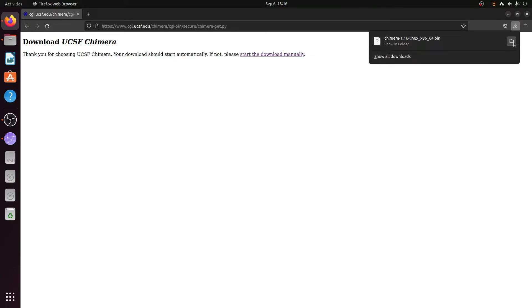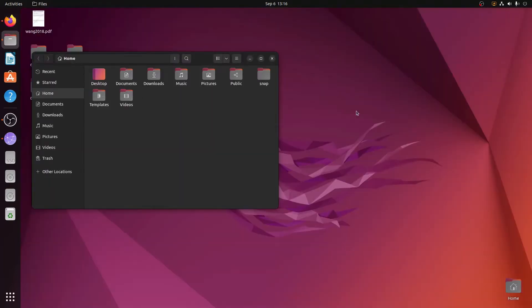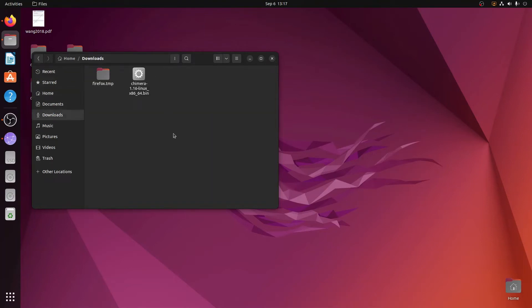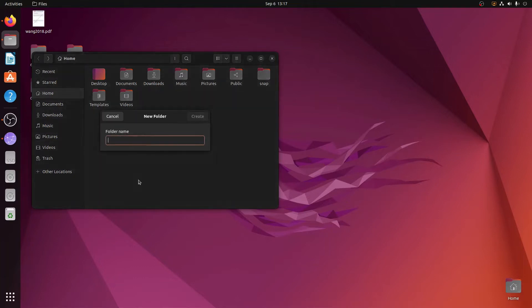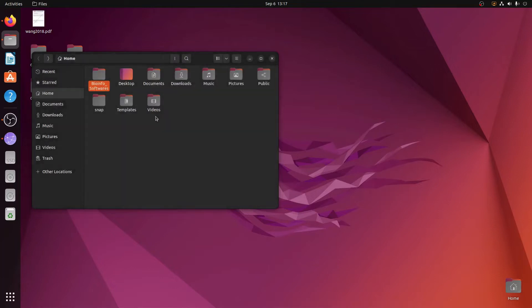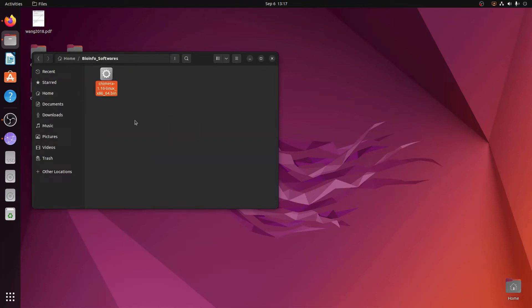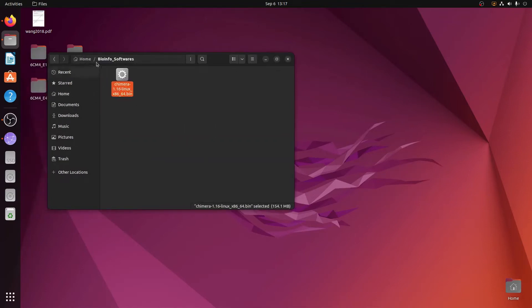I'll show you the correct path. Go to the Downloads directory and open it — this is the file that has been downloaded. Copy this file and move it to a location that is easily accessible and memorable. Create a folder called 'bio info software' and paste the file there. Inside this bio info folder you now have the bin file needed to install Chimera.